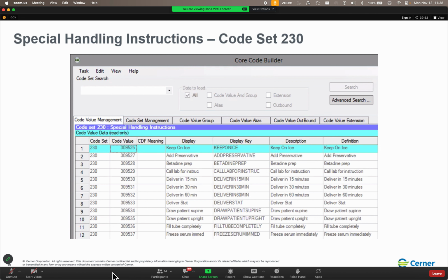Now, you can also define alternate containers in ColRecMate. Again, this is our old school tool. And again, you click on the ellipsis button. You'll have to manually put in the minimum volume, the container, the collection class, the special handling. And again, when you click save, it saves. You don't have to click save again on the main screen. So these are the alternate containers. These are not the aliquots, though.